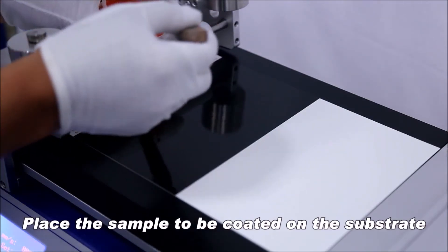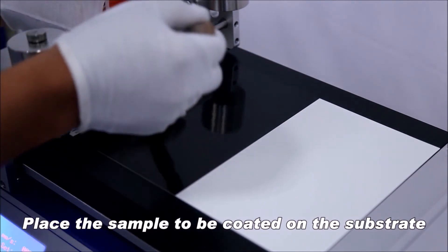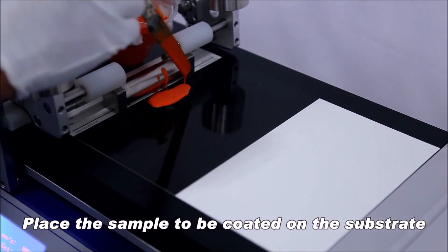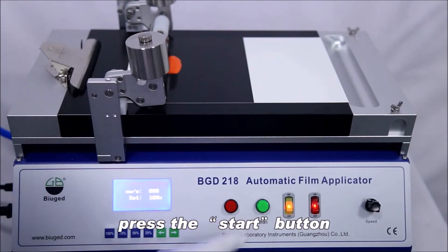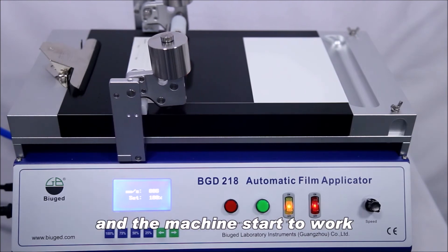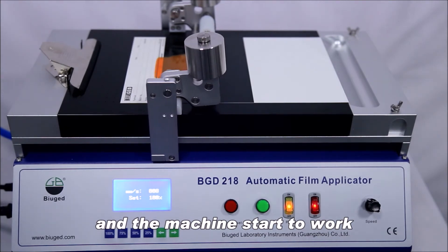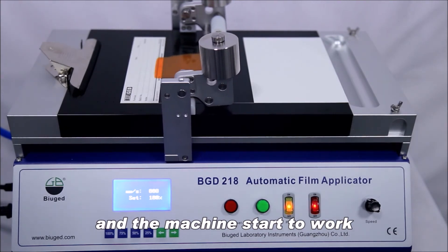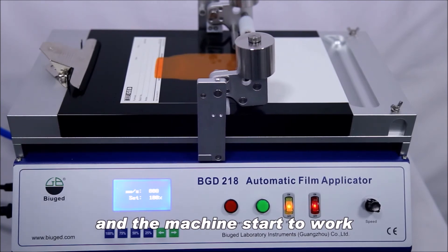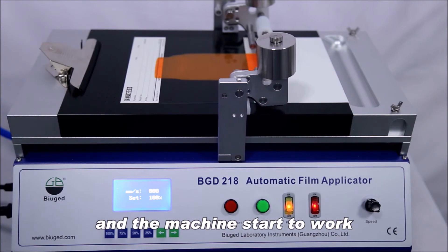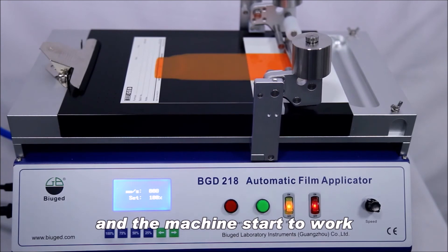Step 4: Place the sample to be coated on the substrate. Step 5: Press the start button and the machine starts to work.